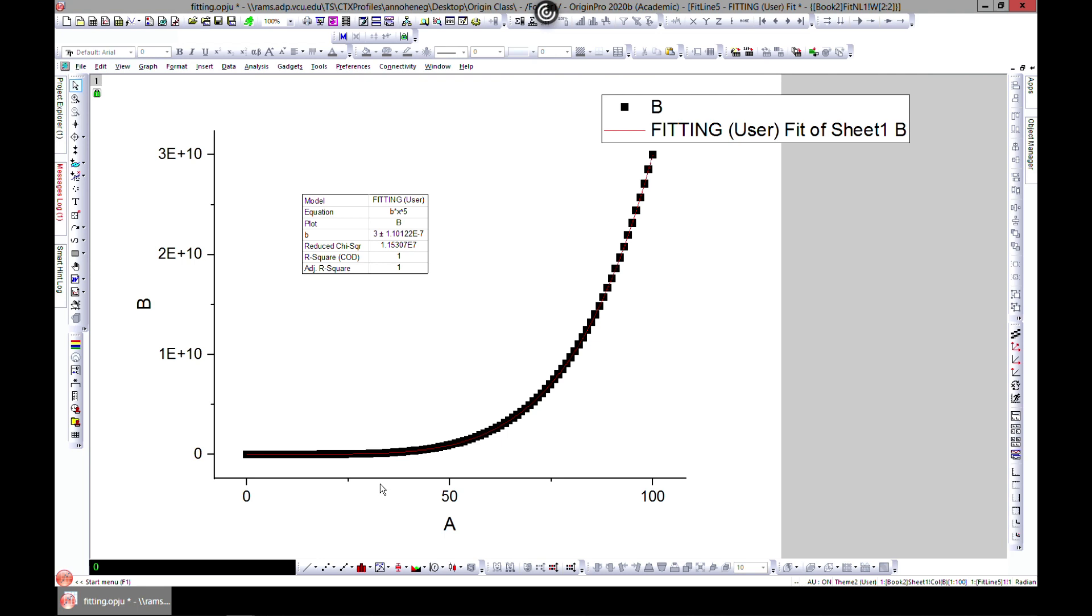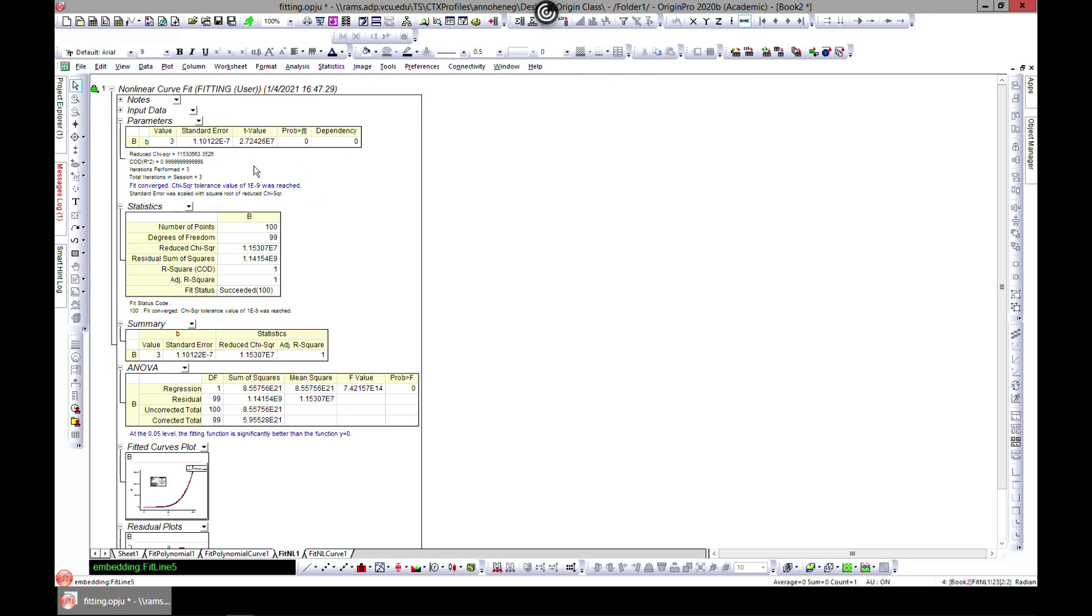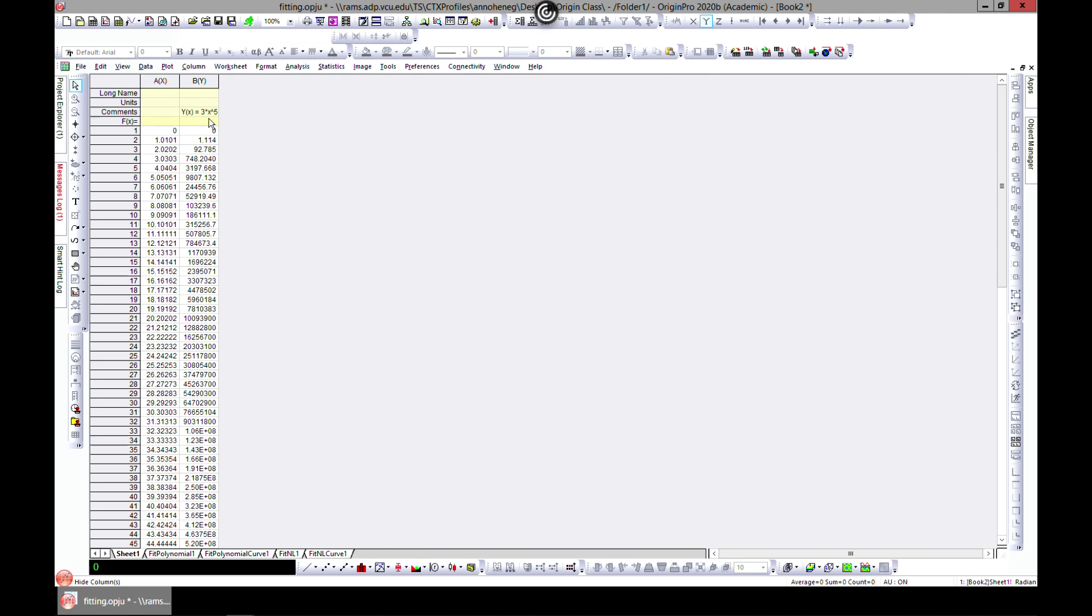fit to your dataset. It gives you your equation and tells us that b is this number. So b is probably 3 times x to the power of 5, which is quite consistent because we used b to be 3x to the power of 5. That is it for nonlinear fit.